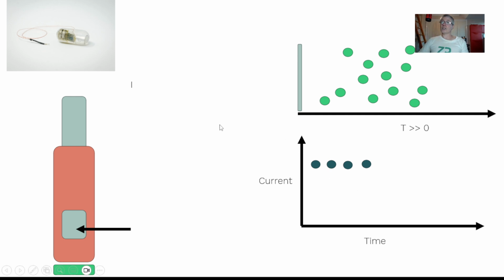Now let's get to the equation. So when I've got steady state at a bare electrode, my current is proportional to n, the number of electrons. This is something you can't control. It's only something you can know. You can know it by knowing what molecule you're oxidizing. F is Faraday's constant. It's the charge associated with a mole.